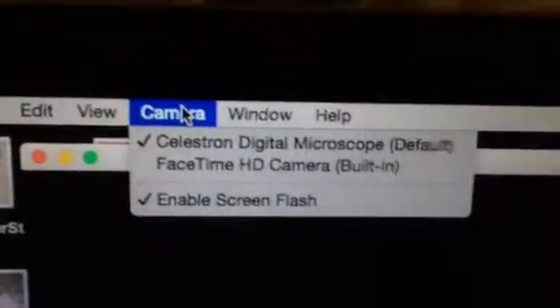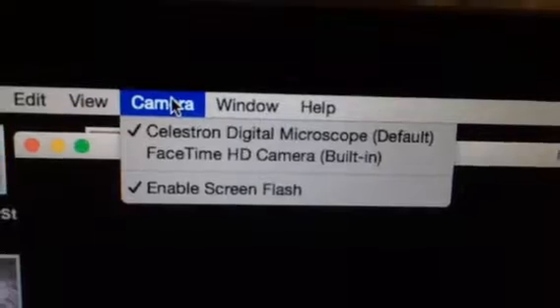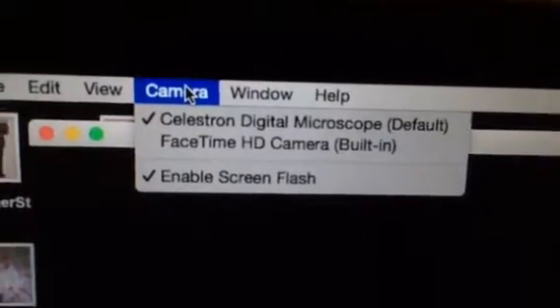And this is the screen I got. You can see that I have Celestron digital microscope selected.